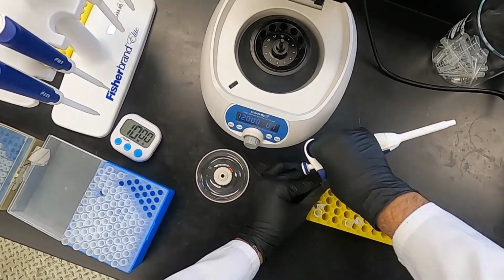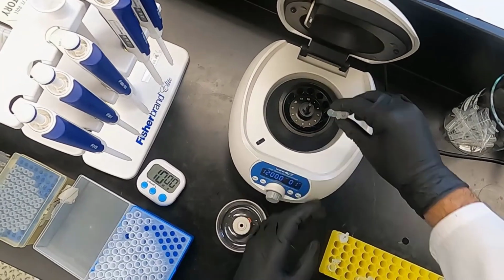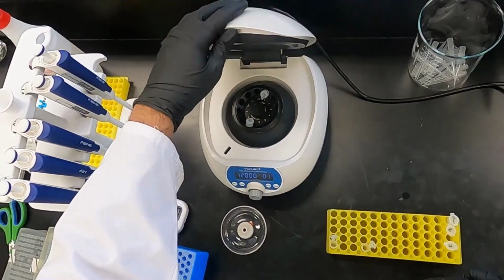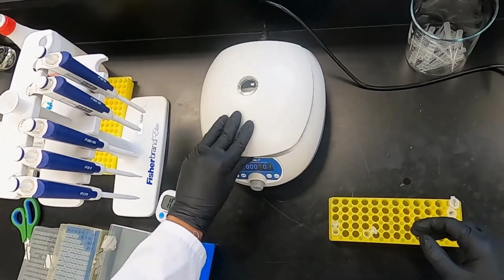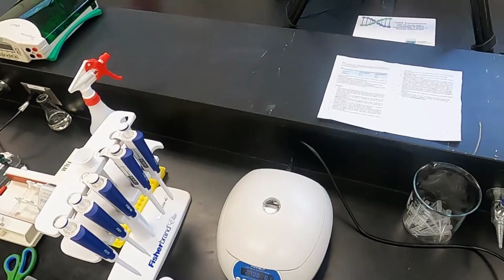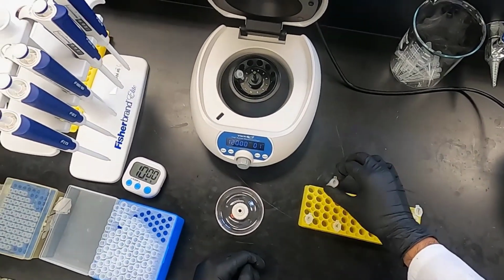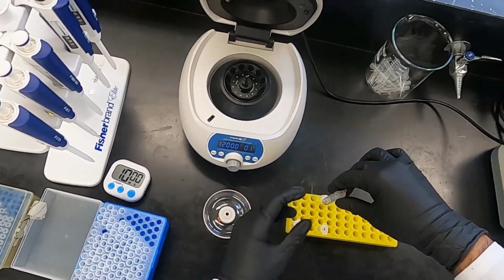And now we're going to repeat the same step once again, making sure they are on opposite sides to stabilize. And same thing, make sure you put the cap on, for 1 more minute. Now that we've collected the DNA spin tubes, we're going to discard the flow through once again. We don't need them. At this point, our DNA is trapped inside the column.